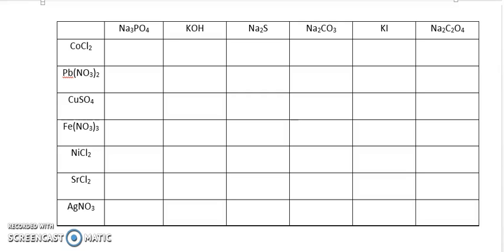So everything is kind of set up in the room today. We are going to be doing a series of chemical reactions, and all of these chemical reactions are going to be done with ionic compounds. As you can see, some of the ionic compounds look a little wacky. Some of them actually have upwards of 3 elements on the inside of them.